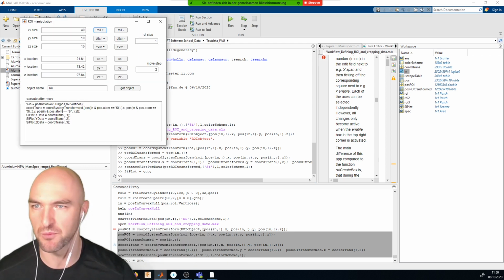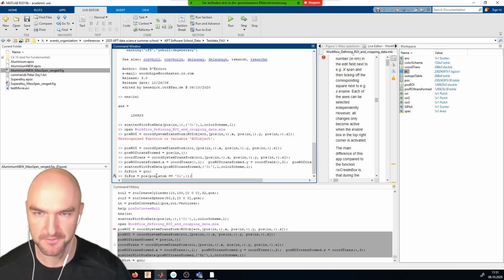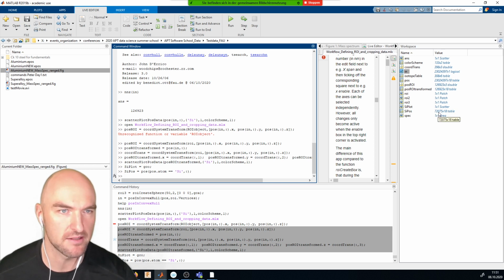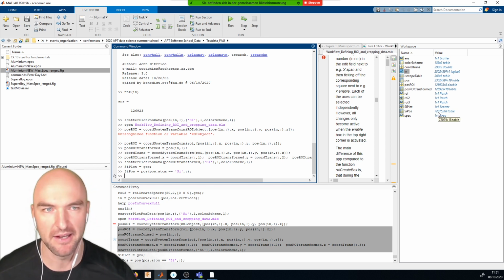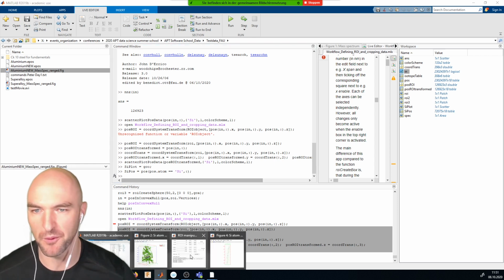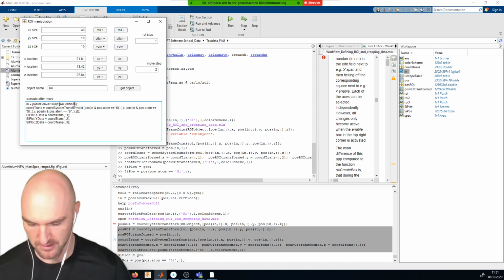But I think one thing that would make it very simple is just to have a silicon pos. So silicon pos being pos dot atom equals silicon and all entries thereof. This silicon thing only has, I don't know, 70,000 atoms or so, and this will calculate much faster, obviously. So what we can do then is go in is pos in convex hull using just the silicon pos.